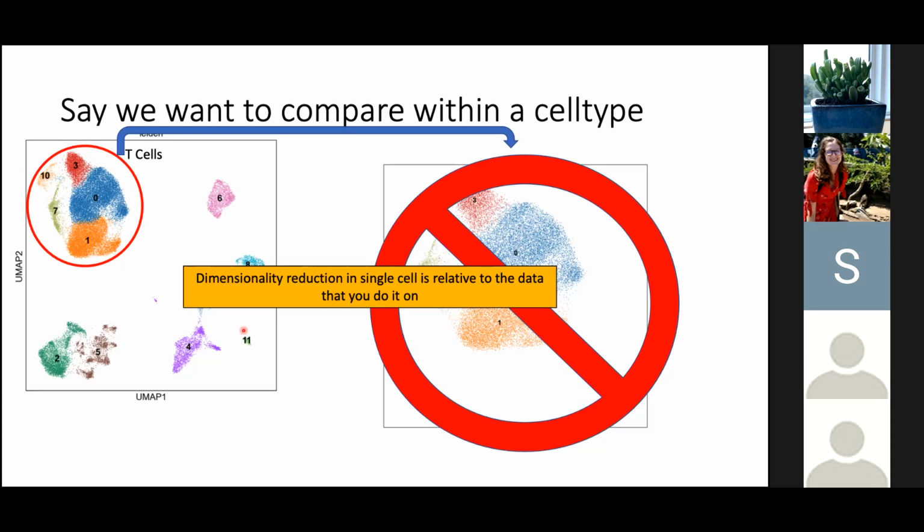One thing that I tried to say when I was going over clustering was that it requires a priori biological knowledge as well. If you're interested in studying some cell types, then choose a higher resolution because you get more clusters. If you don't care, use a lower resolution, because then maybe all of the cells of one cell type, regardless of subcell type, are clustered together. So I think the answer is first that it is unanswerable, and cell type annotation also requires intimate biological knowledge of the system. So it's a difficult one.